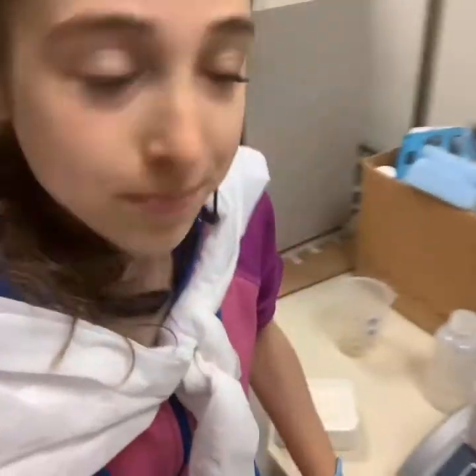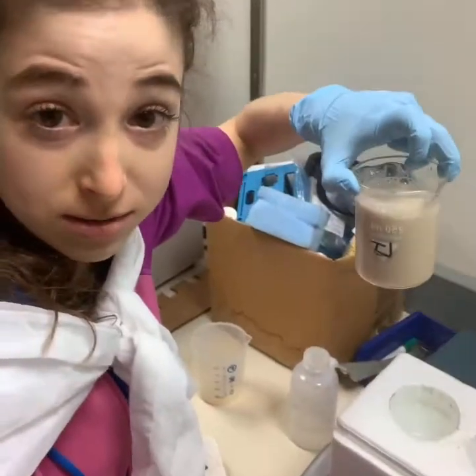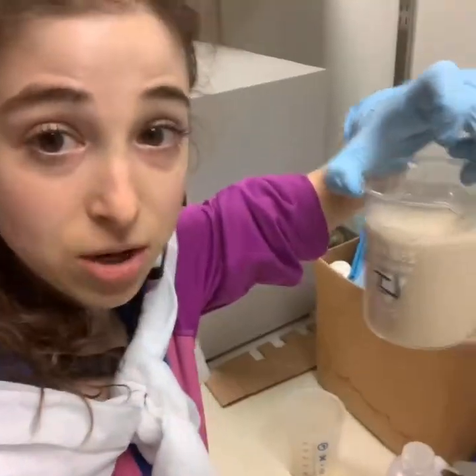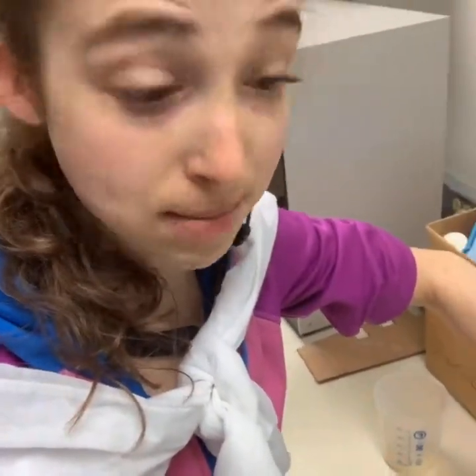Right now I am starting a protein purification. I had bacteria express a protein I'm interested in by putting the genetic recipe for it into the bacteria. These are the cells that, after they made the protein, and my job now is to break them open and purify the protein.